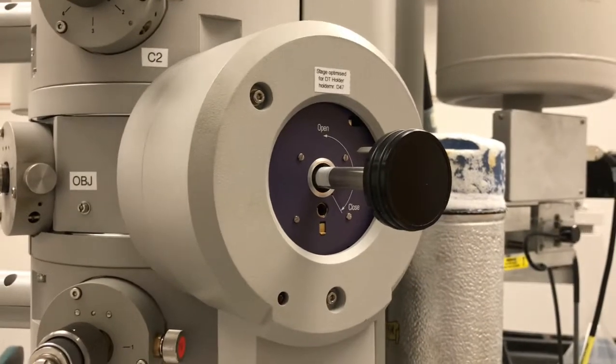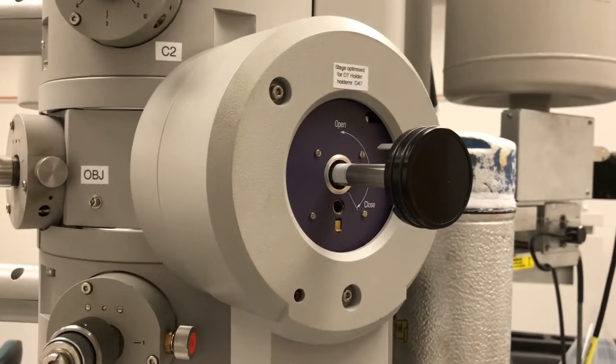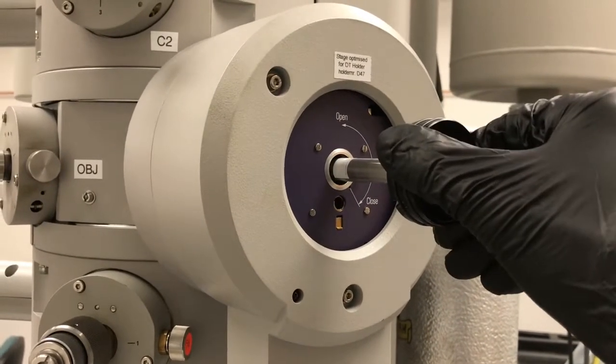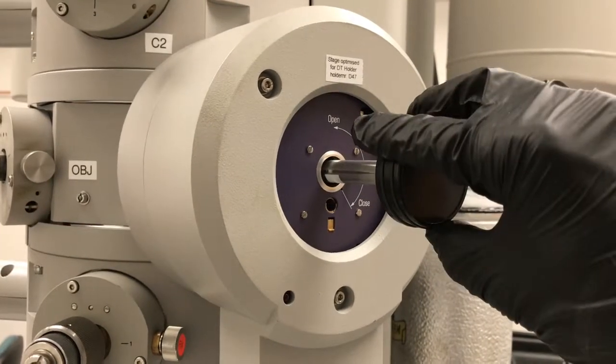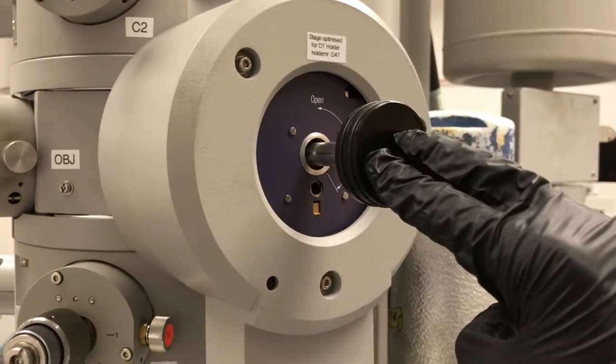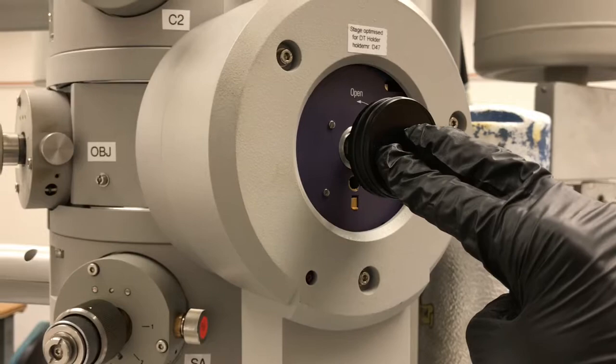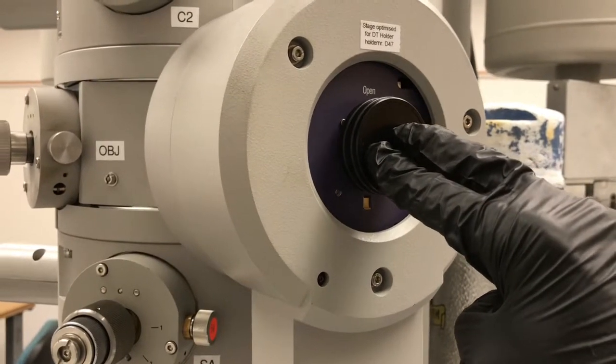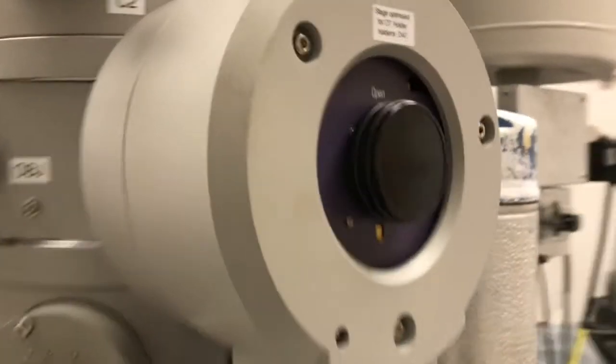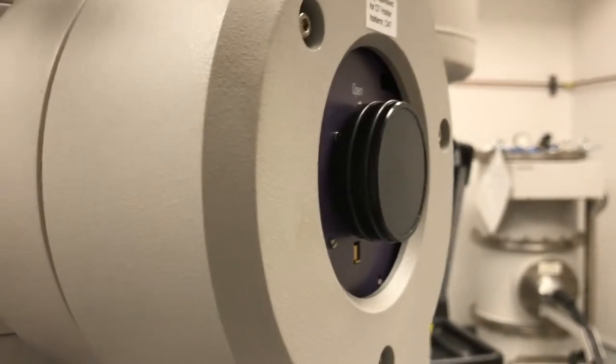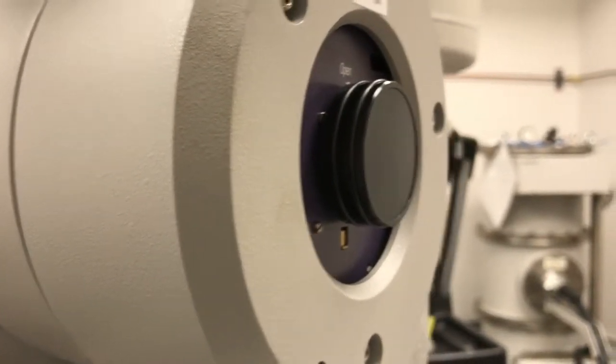Counterclockwise turn, there's the stop. And now if this is in all the way, you should see basically that the holder base is flush against that purple plate.